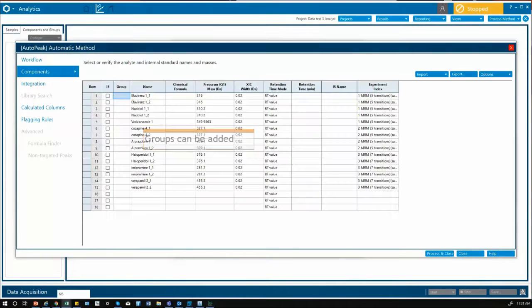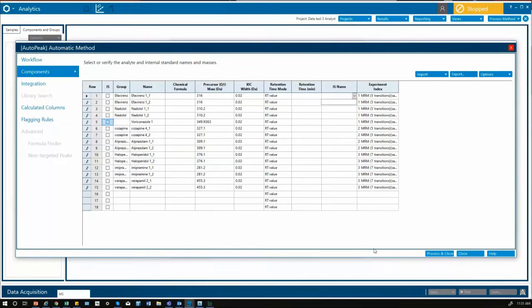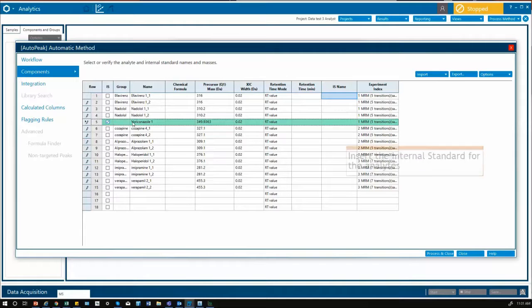Now you can look at your components and add a group if you require. I'm going to add an internal standard and use this for all my analytes.